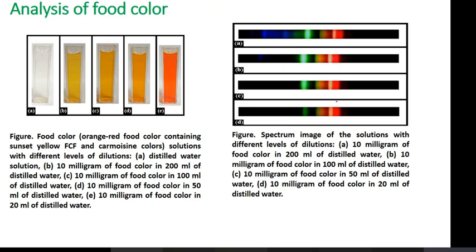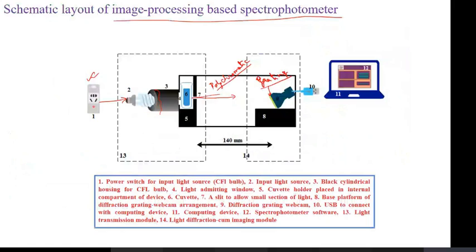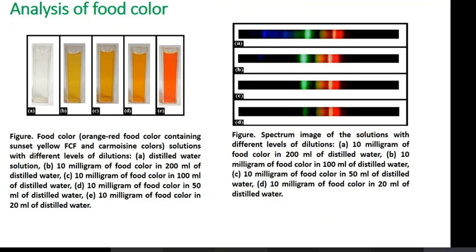This device was developed by one of our students in our lab. Since I am in the medical electronics and instrumentation lab, the student has devised this, and through that he has captured some spectrums. So if you look into the spectrum, what is this? Can you see? It is just breaking down the different components of light into different bands. Are you getting my point?